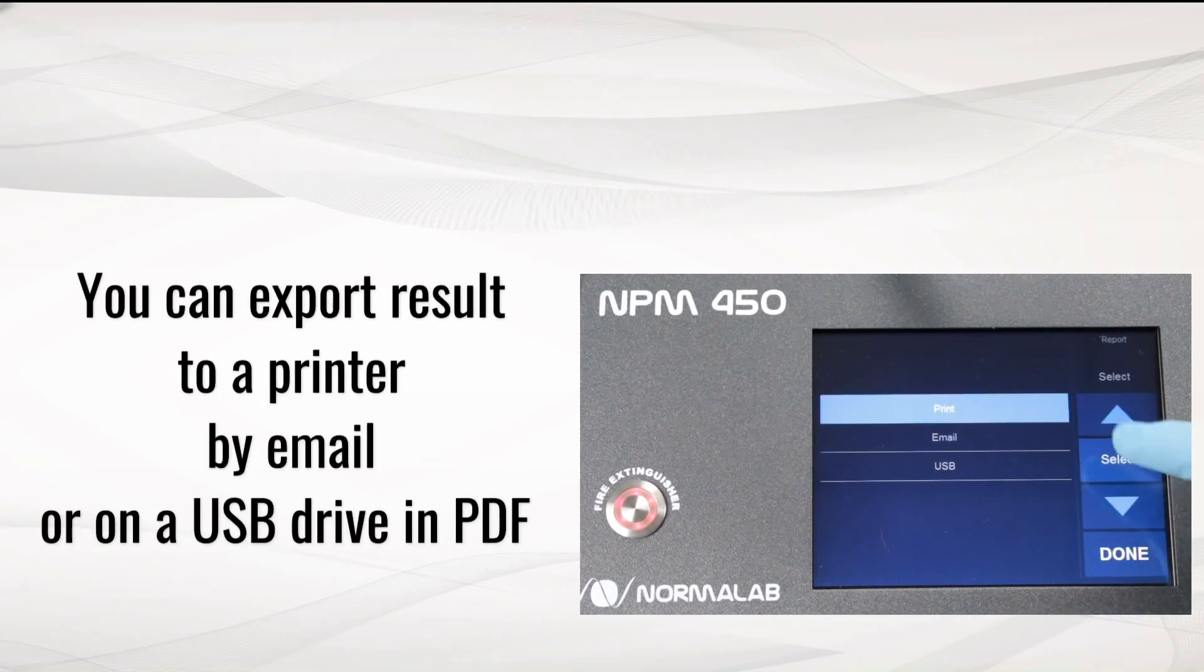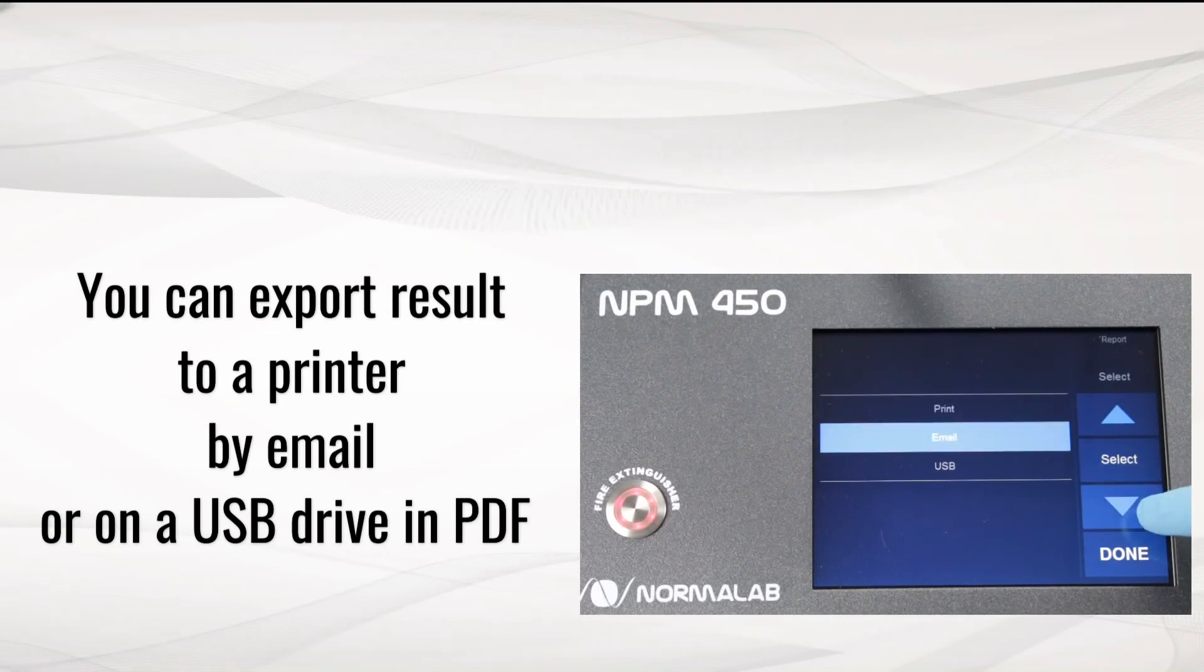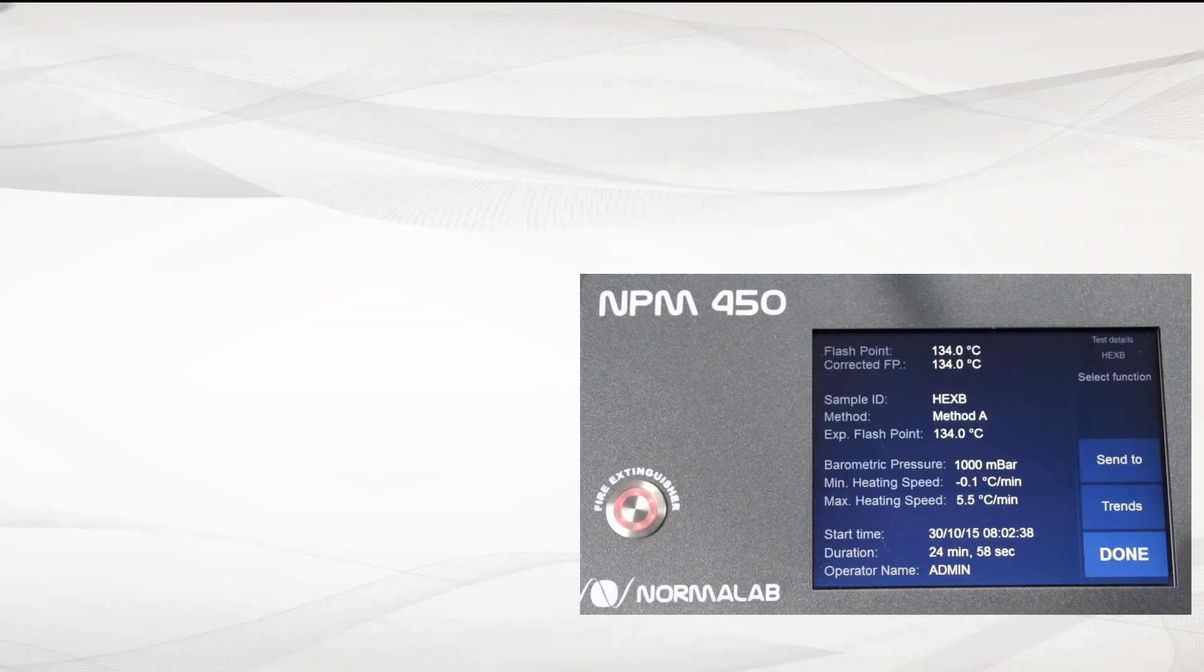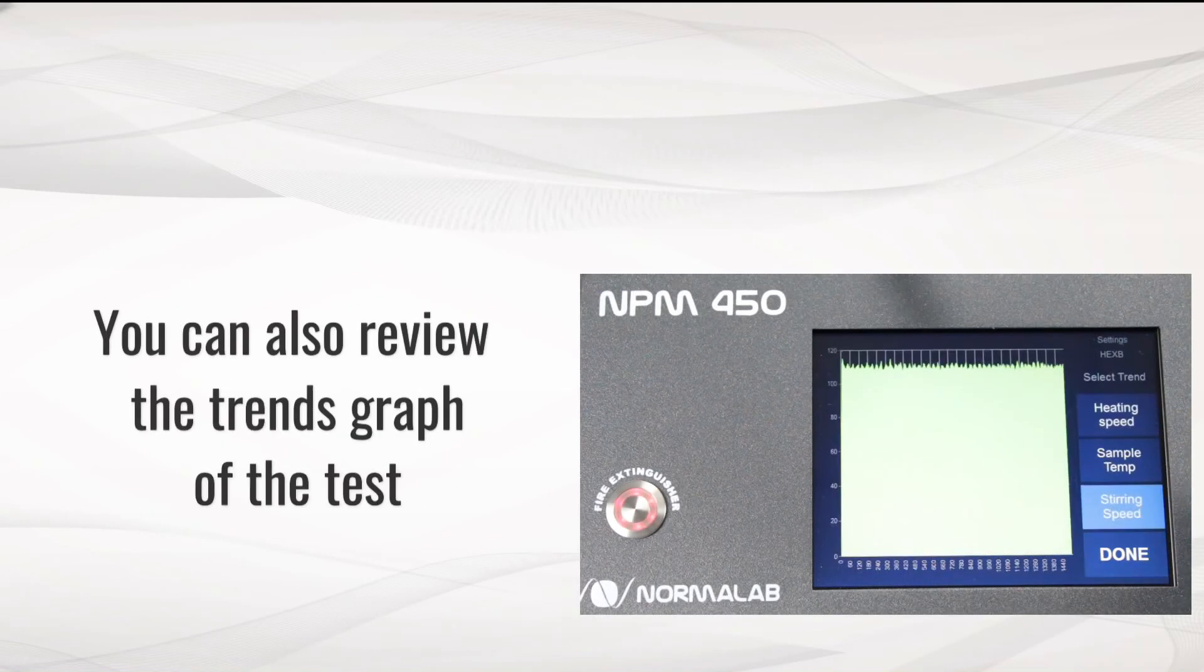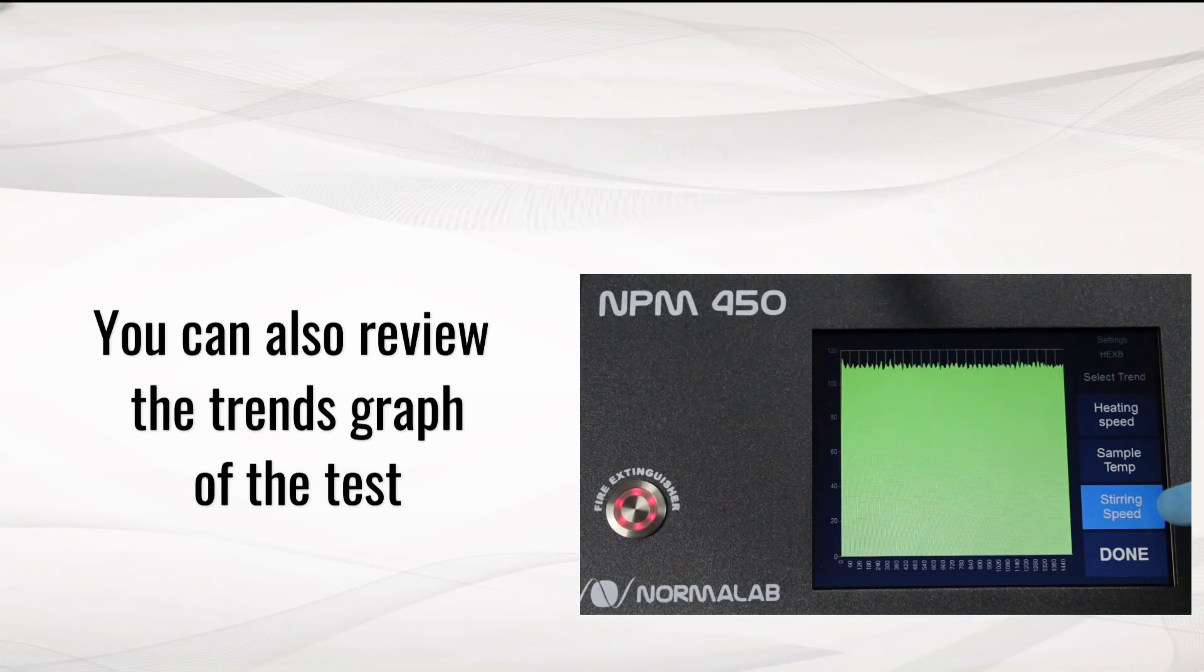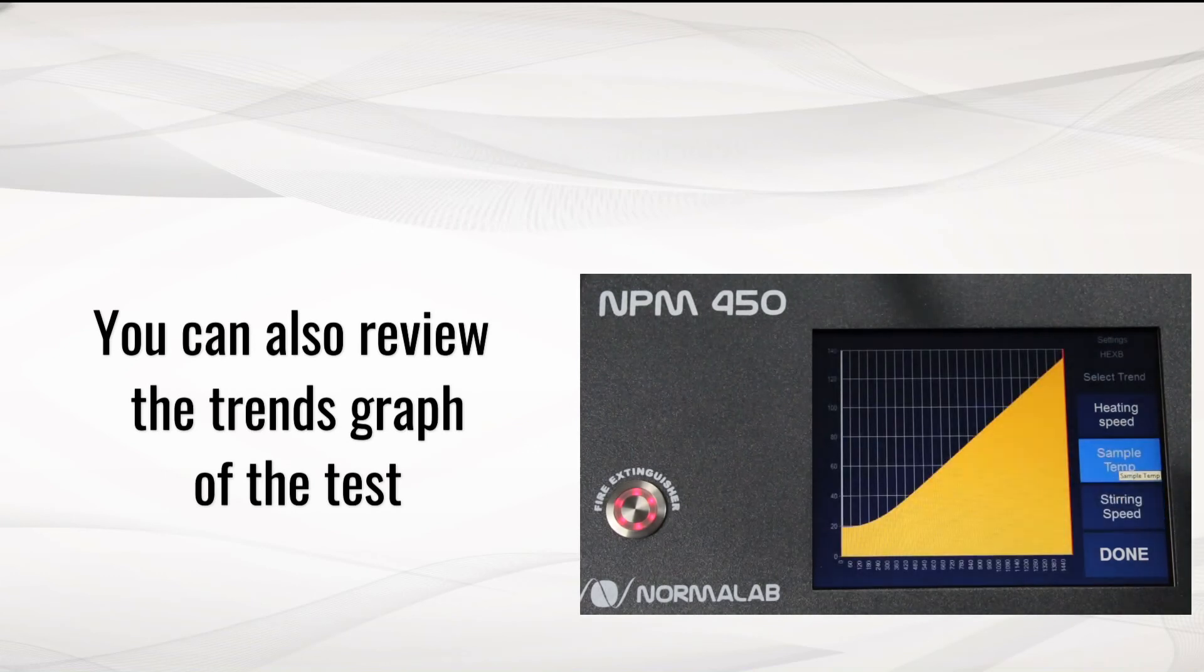You can then export the result to a printer, by email, or on a USB drive in PDF format. You can also review the trends graph of the test.